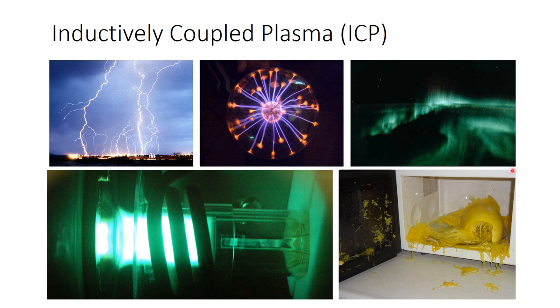So in a microwave, you have microwave electromagnetic radiation, which interacts with water in your food. And I think this is some kind of butternut squash or something like that. And someone's put it in the microwave, and the microwaves have caused the water molecules in the squash to vibrate, and that vibration has caused the temperature to rise, and then ultimately the squash has exploded. And that is similar to what happens in this plasma here, in that the alternating, in this case radio frequency, field causes the atoms of argon to oscillate, and that raises the temperature.